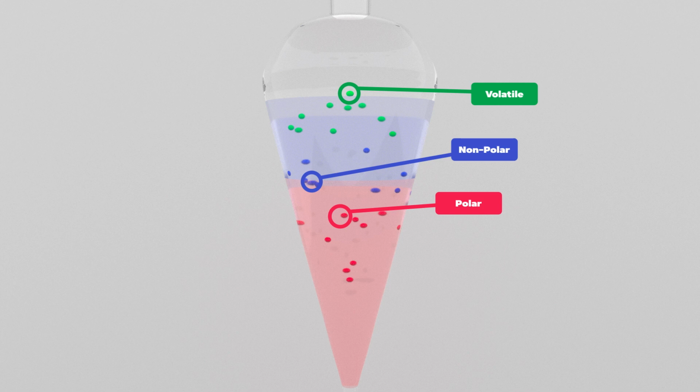So let's start from where we left off. We've been tasked with separating compounds to be able to identify and quantify those compounds. We've already determined that we can use polarity to separate compounds. What else can we use? Well, we can also observe that temperature may be a physical parameter that we can use to separate components.